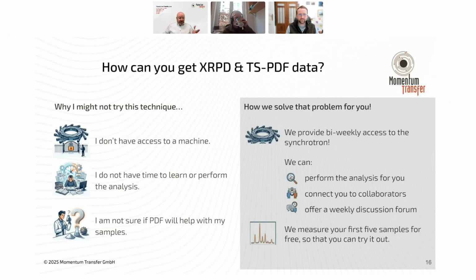So you can go to our website right now. We measure the first 5 samples for free. And then you can actually use search match as well. There were a bunch of questions if the search match was actually for free. Yes, this is for free. So you just register, you upload your data, you can use it. You can provide us feedback. That would be very helpful, actually.